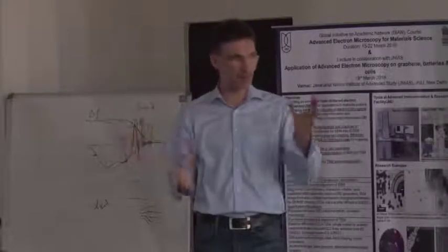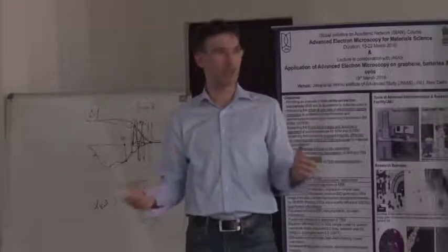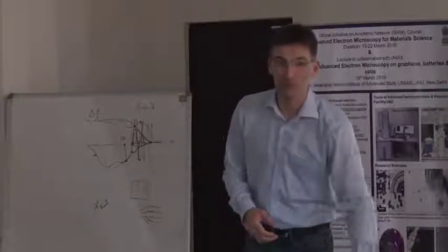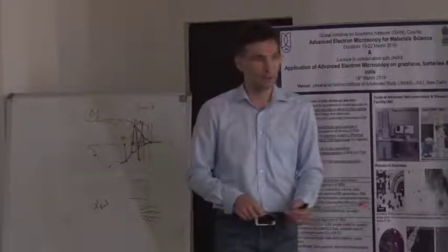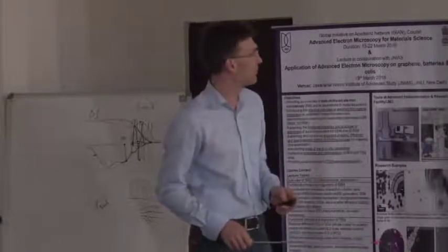Then you adapt certain parameters for the alignment and the reconstruction, and in the second step you do some iterative reconstruction. So it's a little bit more complicated than just back projecting all the information in real space. There are various approaches to optimize that.